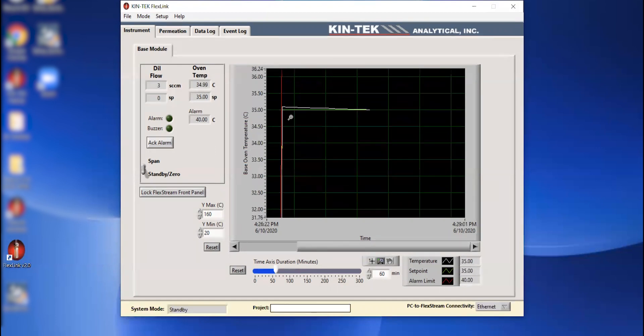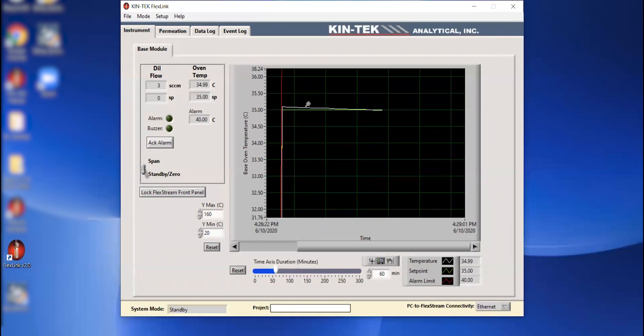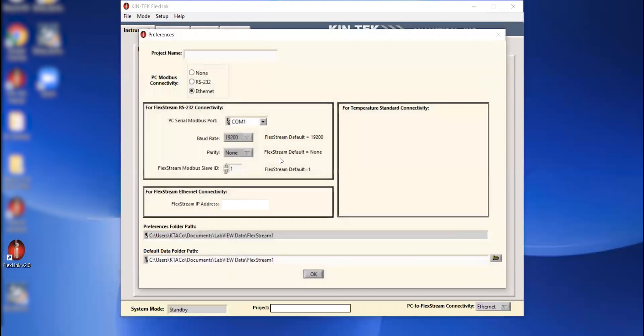So that shows you how to connect. We go through the setup preferences screen to connect. We would set up our connection. Just a quick overview. We hit OK and everything should be communicating at that point. So once it starts communicating, we can see everything actually working.